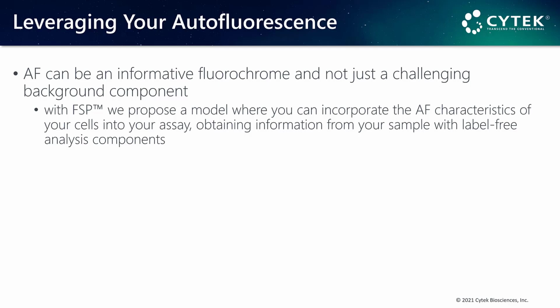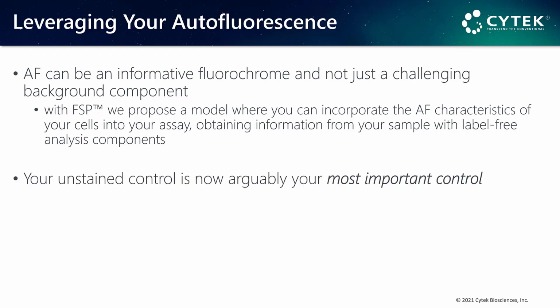your data set. I no longer think of autofluorescence as just a challenging background component that I need to work around. With full spectrum profiling, we're proposing a model where you can incorporate that autofluorescent characteristic of the cells in your assay, obtaining information from your sample with a label-free analysis component. Now that I've spent a lot of time working with autofluorescent samples, I find these the most interesting samples to analyze. But never forget that now your unstained control is arguably your most important control.